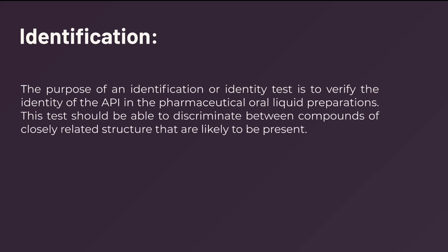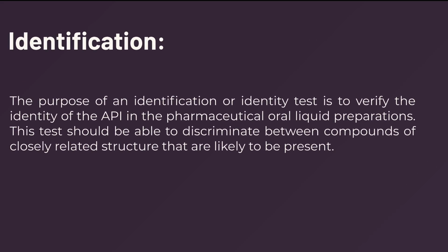Second, identification. The purpose of an identification or identity test is to verify the identity of the API in the pharmaceutical oral liquid preparations. This test should be able to discriminate between compounds of closely related structure that are likely to be present.